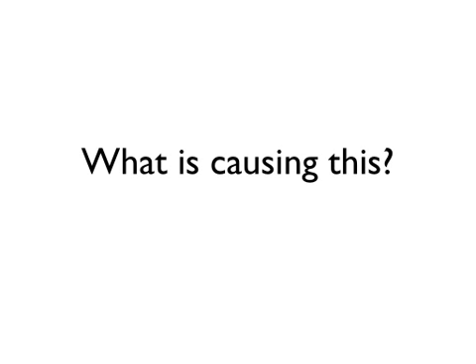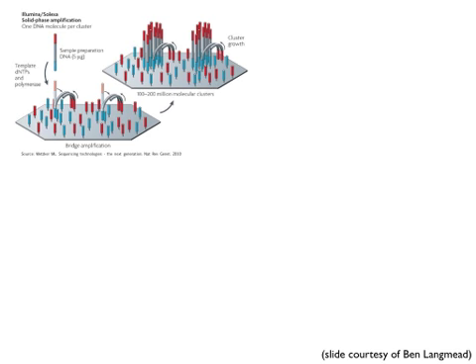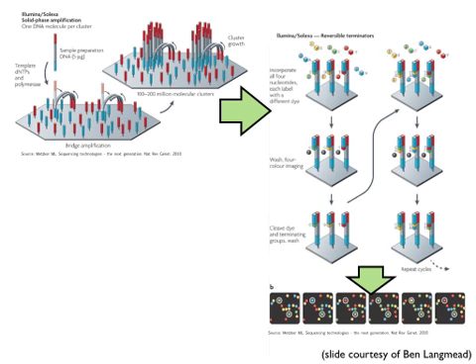So what causes this? We're going to go back to the beginning, where we explain how the technology works, and come back to the images. For each one of these little circles that you see down there, that's one read. A read will come from each one of those.